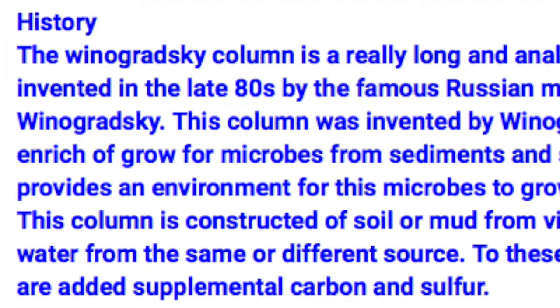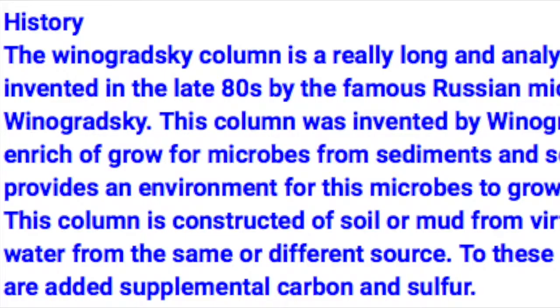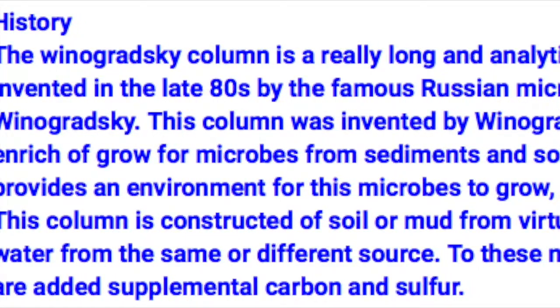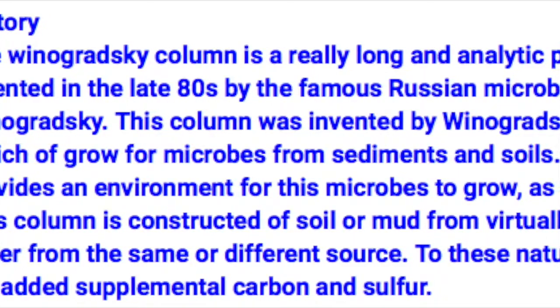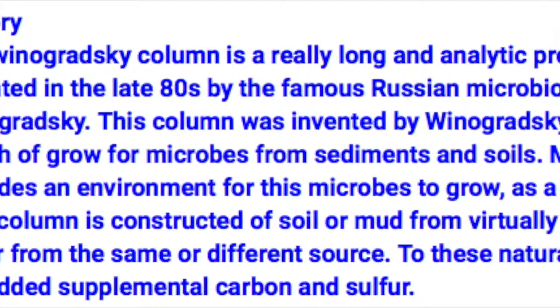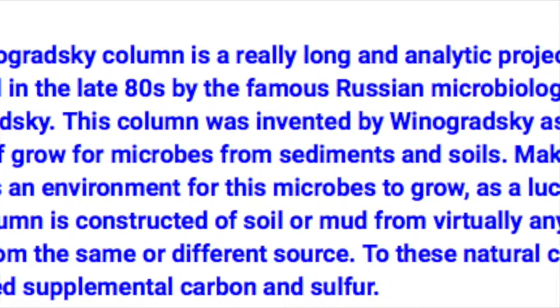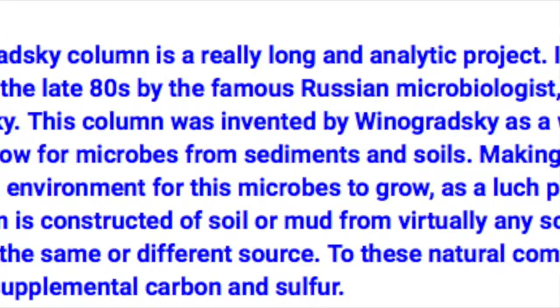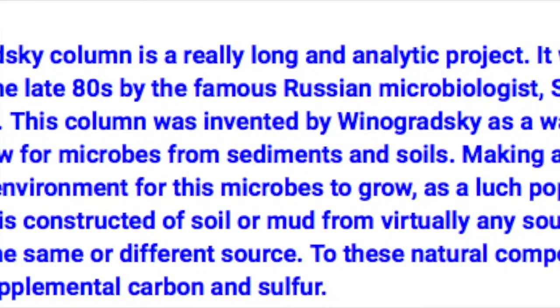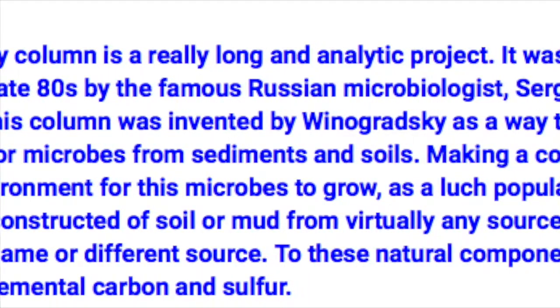So the history of the Winogradsky column is a really long and analytic project. It was invented in the late 1800s by the famous Russian microbiologist Sergei Winogradsky. This column was invented by Winogradsky as a way to enrich and grow microbes from sediments and soils. Making a column provides an environment for the microbes to grow as a large population.